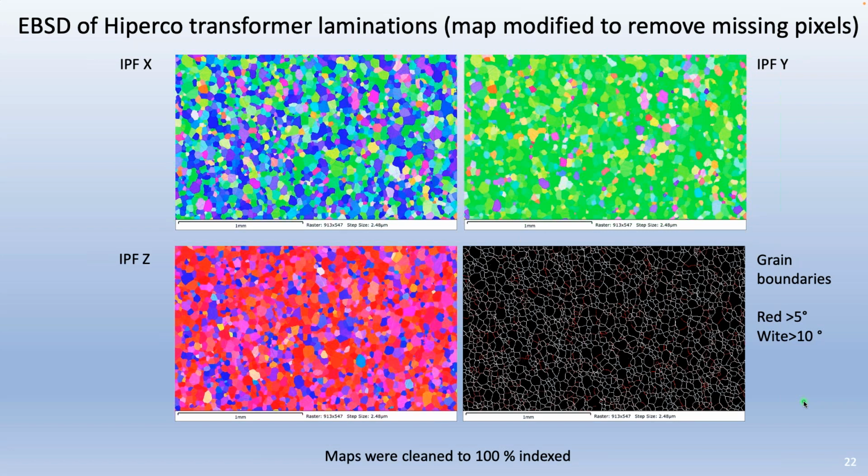I've done this in the past. There's a good paper out there by George Vandervoort that talks about identifying carbides. I did some work with George on that paper. You might want to look that one up. Again, that's a case where you're going to have to be very careful. You can maybe use EDS to help you. The M23C6 generally, I think, are chrome rich. M7C3s can be a variety of other elemental species in them. One has to be careful when doing these.